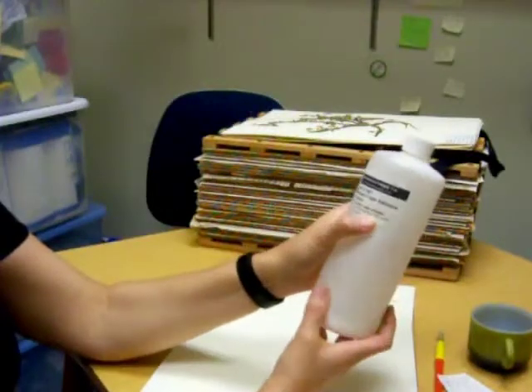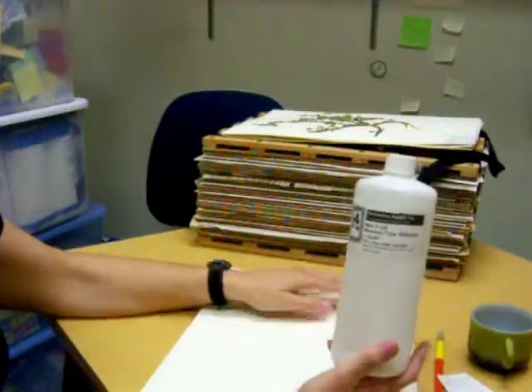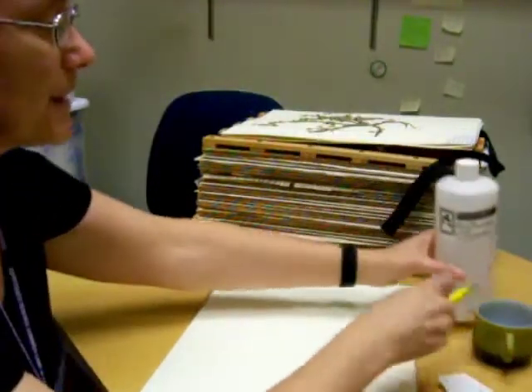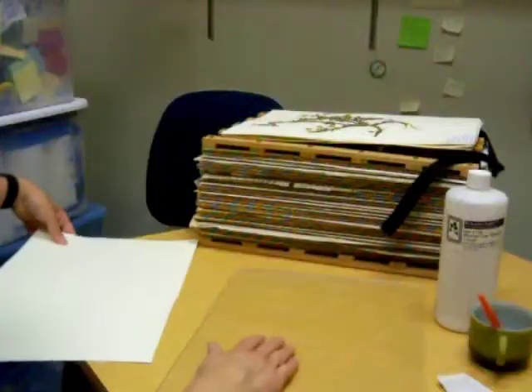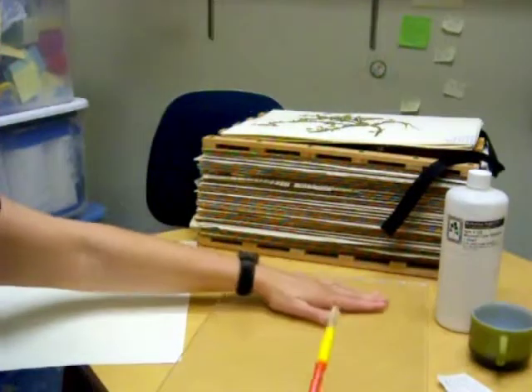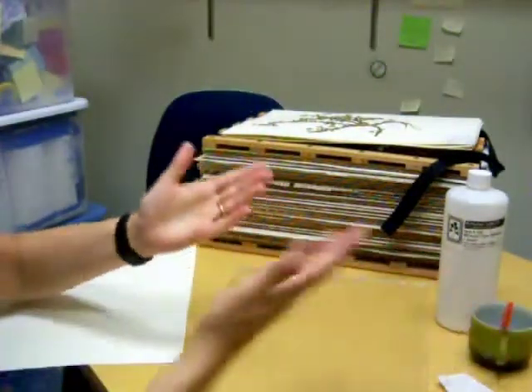It can only be thinned up to 30% with warm water. So what I would do is add some of this glue to this cup, mix in a little bit of water until it was a smooth consistency, and then put the glue all over the specimen so that there was a thin sheet of glue everywhere.